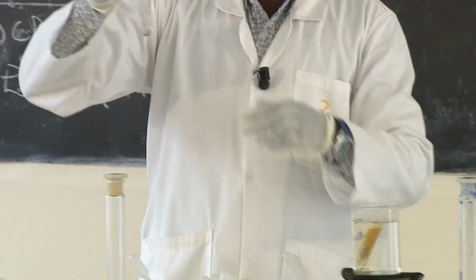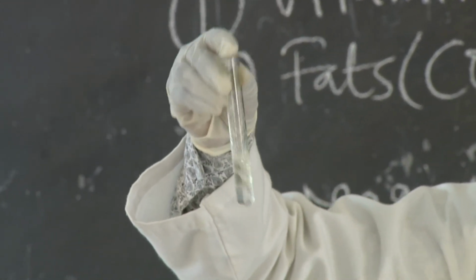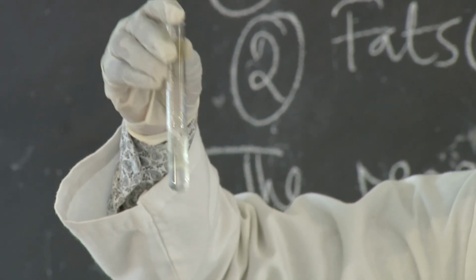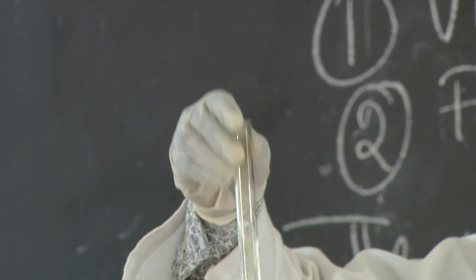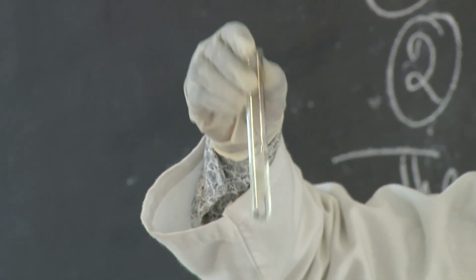Add water and shake. Shake gently and see what is taking place.